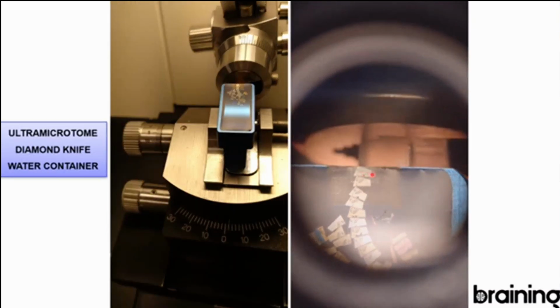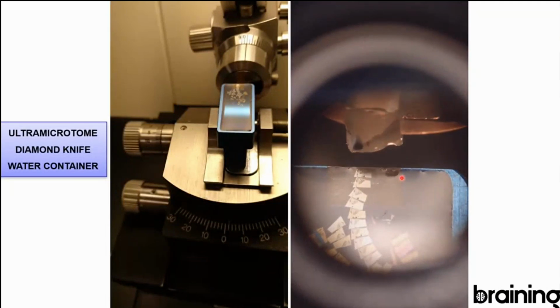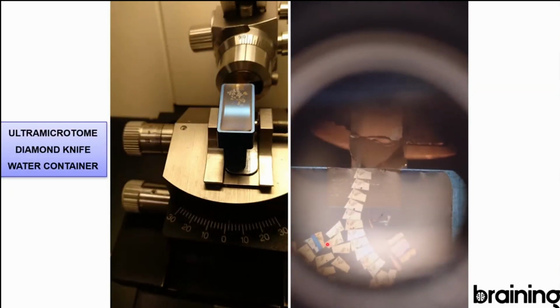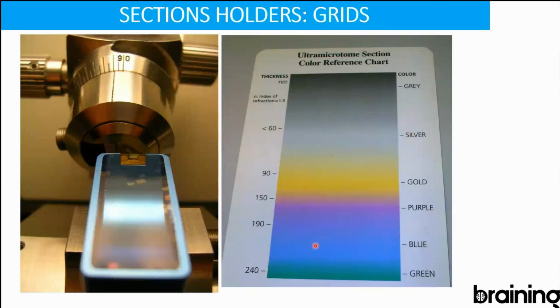So you see they have a kind of yellowish color, more a gold color, and that's because they are really thin. I don't know if you can see there's some other blue or a little bit darker colors over there, and those are thicker sections. How do I know the sections that I need to look at in the electron microscope?